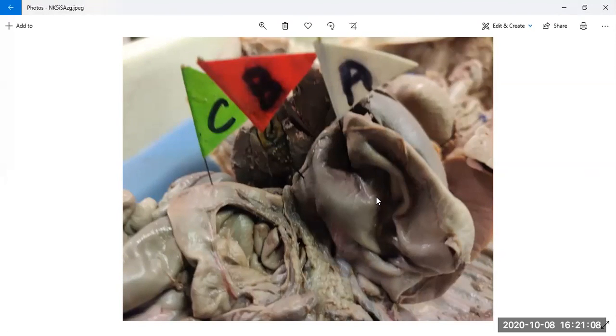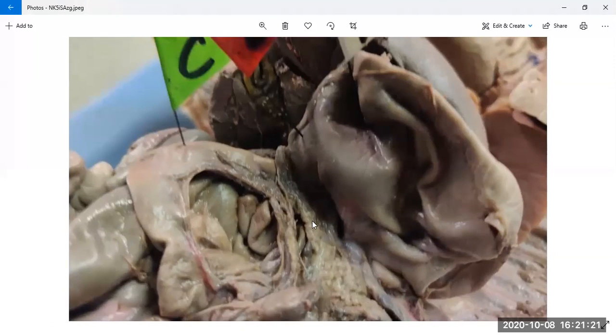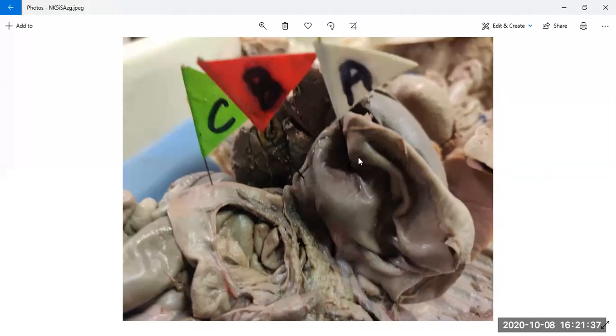Yeah, this I couldn't tell because I don't know if this is the stomach all in all. But what I can tell is you see this part has this grain structure and looks like the pancreas. And the pancreas is always associated with the stomach and small intestine. So I believe this is stomach, and this is the fundus part of stomach, and this one is the pyloric region of the stomach, and it looks like it is leading to the duodenum. But I cannot be sure about this one because, to be honest, the picture is out of context.